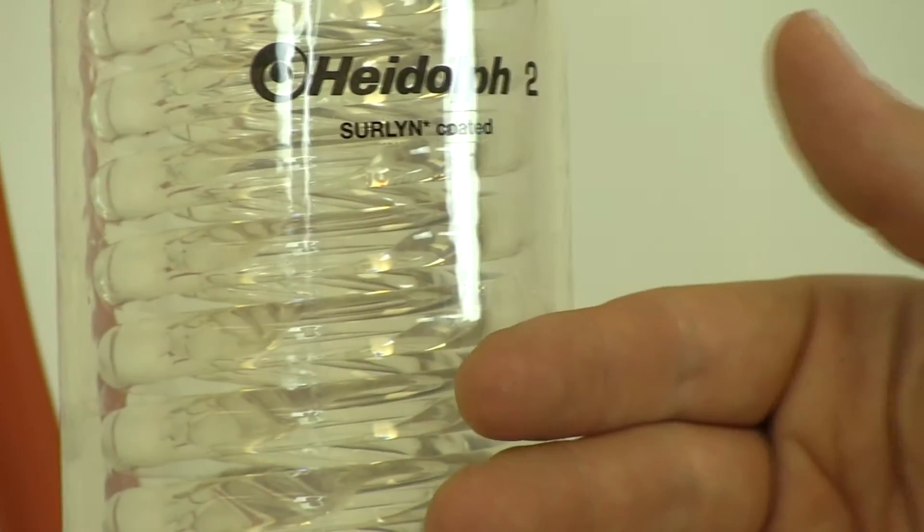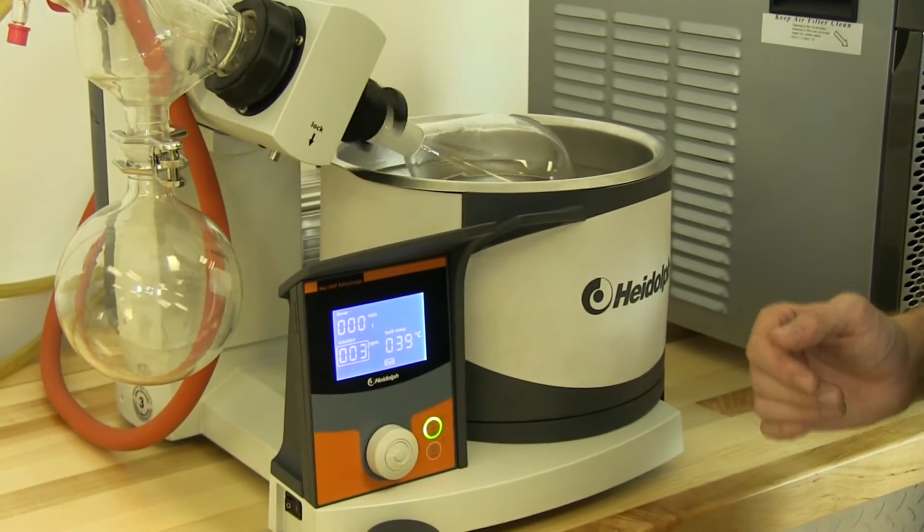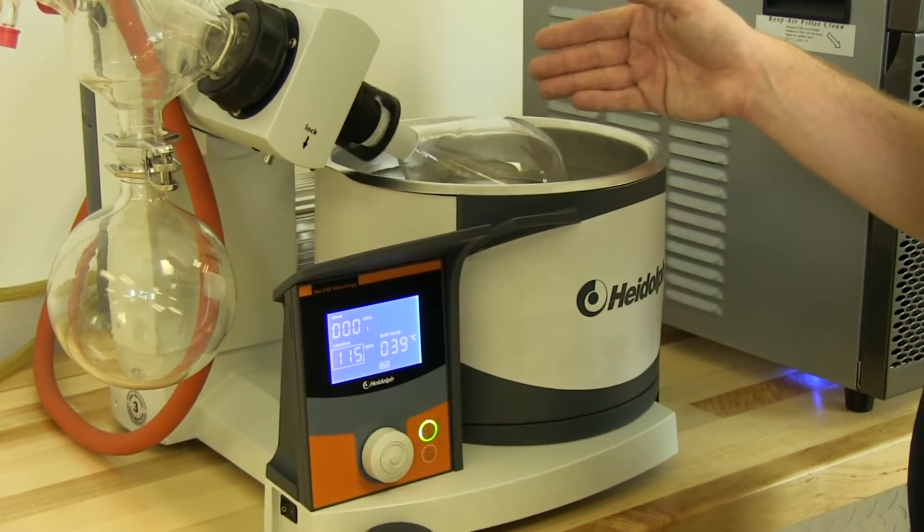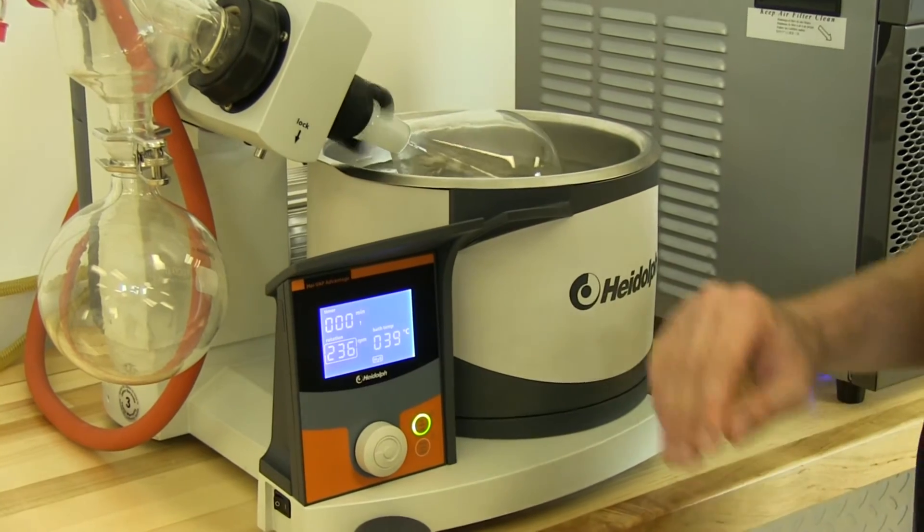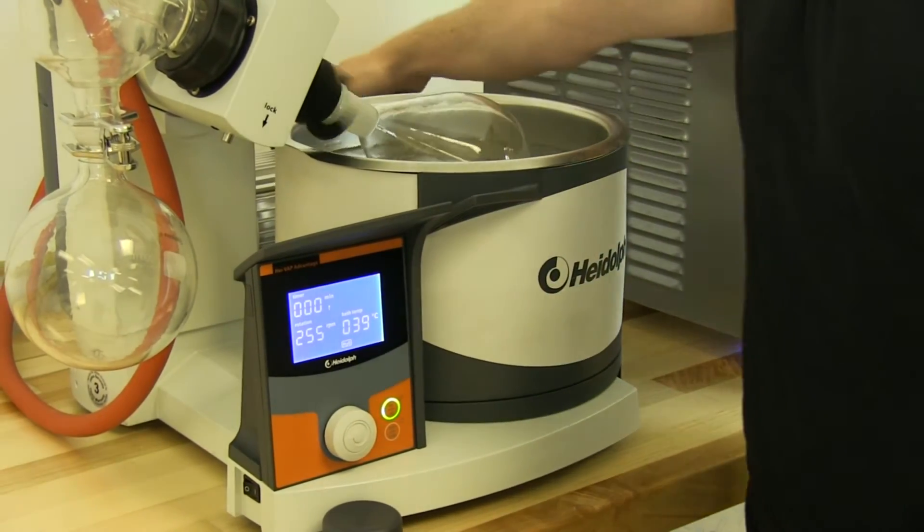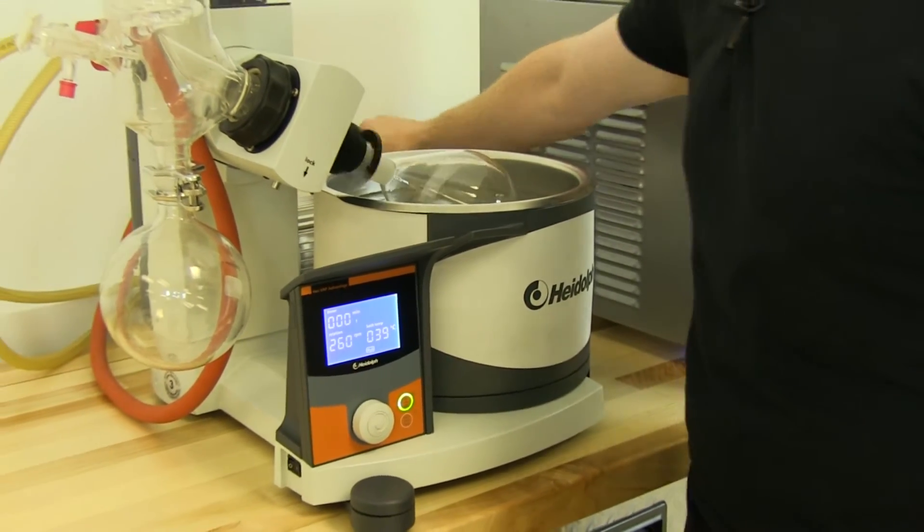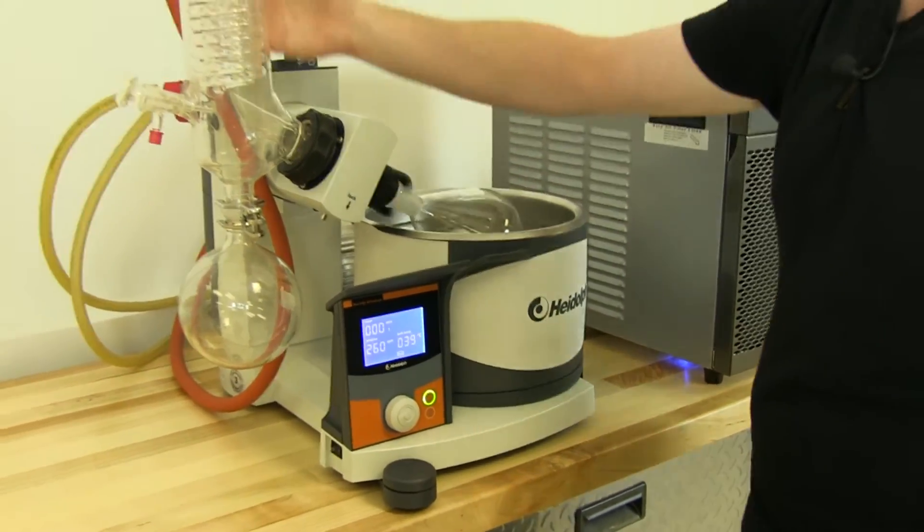Once we have reached our temperature in here, we can heat our bath. We can start rotation. We have this rotating at about 260 RPMs. Turn on our vacuum pump. Draw a vacuum on the entire system here.